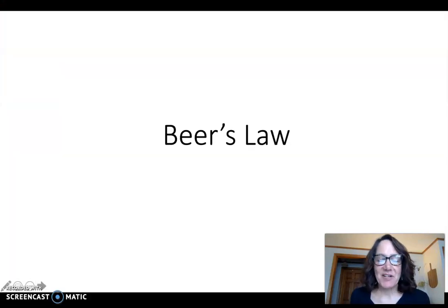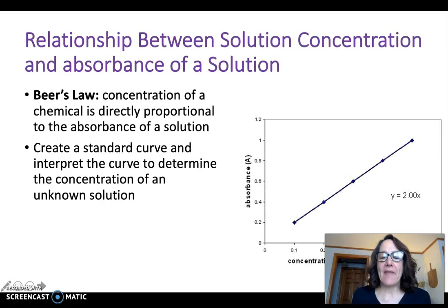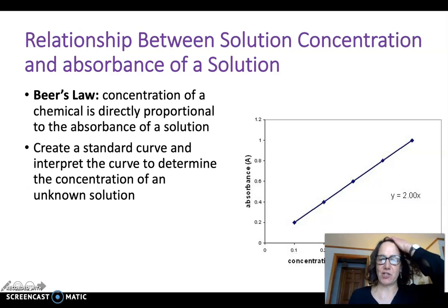Hey guys, I just have a quick little introduction to Beer's Law for you. And if you open the lab handout document on Canvas, the background information goes into a little bit more detail. So there's this guy named Mr. Beer who, with a couple other scientists, came up with this relationship between solution concentration and absorption of a solution.